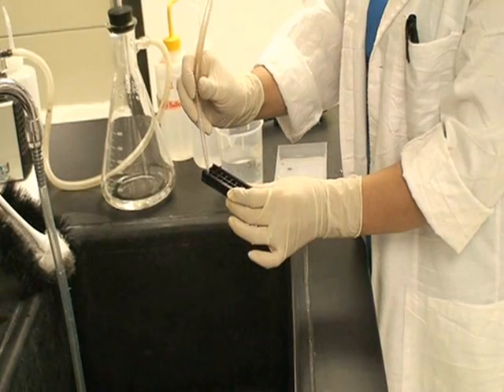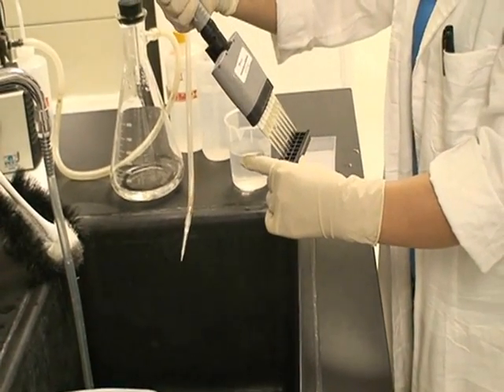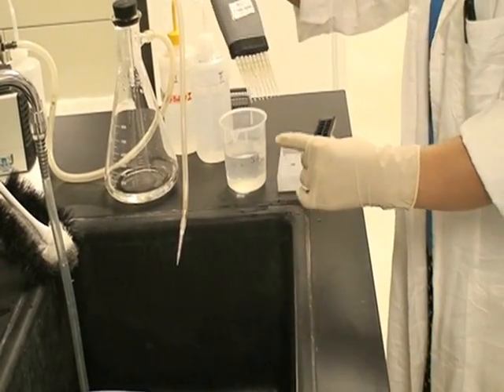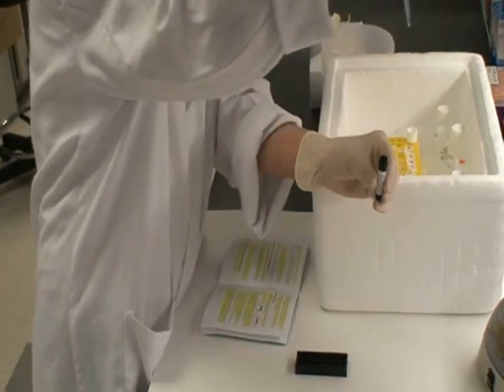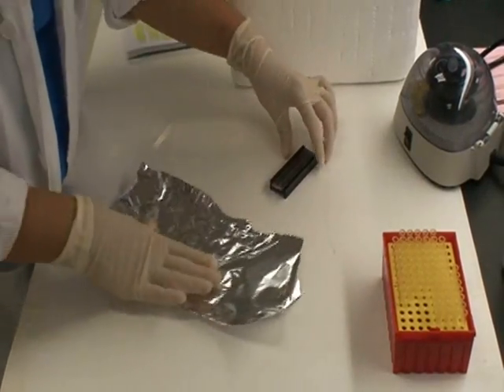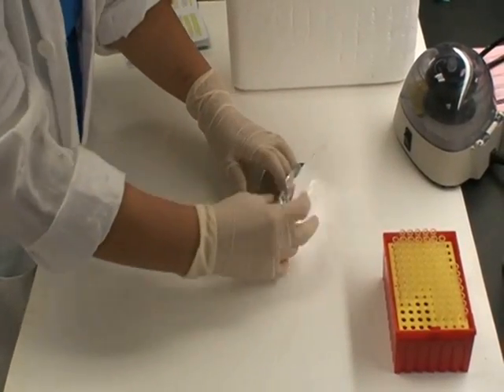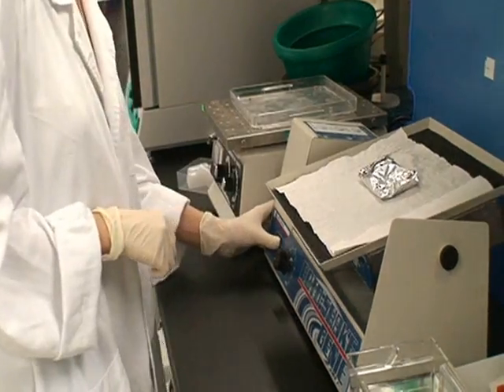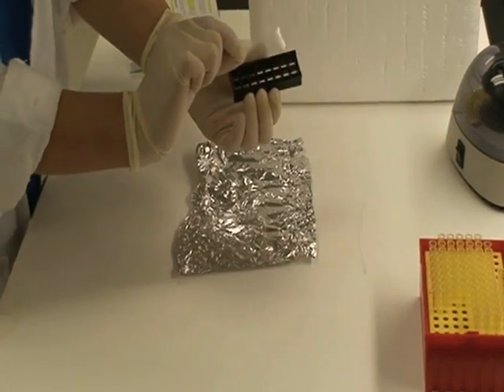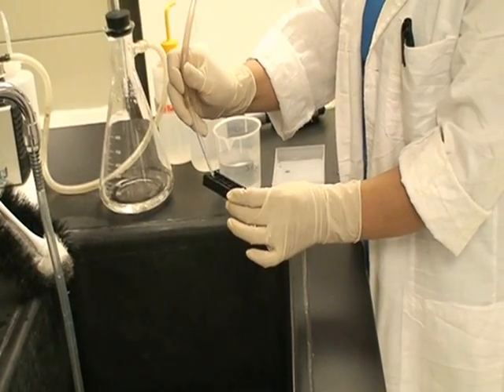Decant the antibody from each well. Then wash the slide as before, and be sure to completely remove the wash buffer after each step. Add 80 microliters of streptavidin conjugated fluorochrome to each well. To avoid exposure to light, cover the slide with aluminum foil or incubate in a dark room. Incubate for 1 hour.